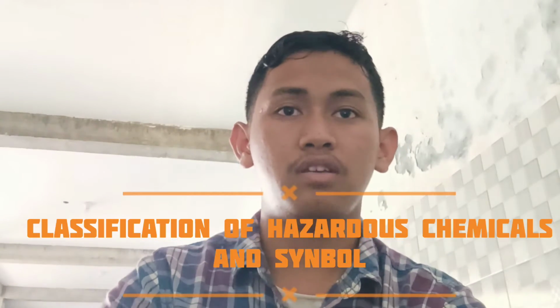Next is the classification of hazardous chemicals and hazard symbols. There are one, two, three, four, five, six hazardous chemical and hazard symbols.